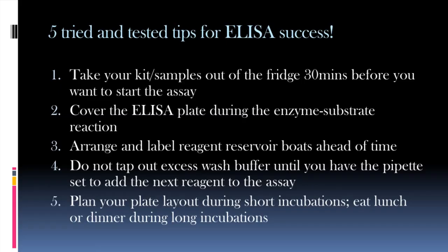Thirdly, arranging and labeling your reagent reservoir boats ahead of time. This is a very important step for me. There are many instances where ELISA plates will dry out, and this is pretty detrimental to the ELISA assay. So you don't want your ELISA plate to dry out.